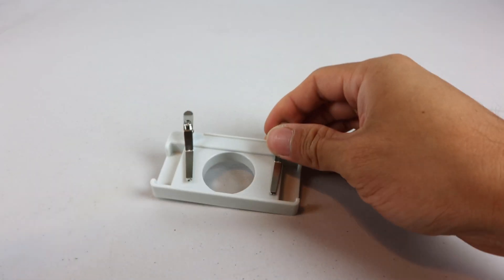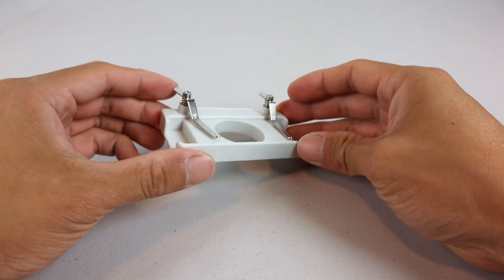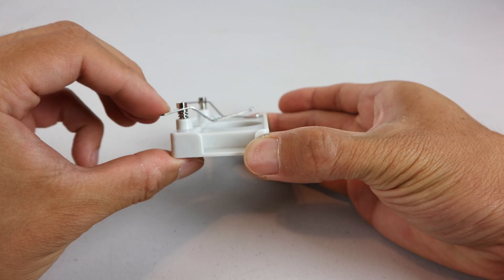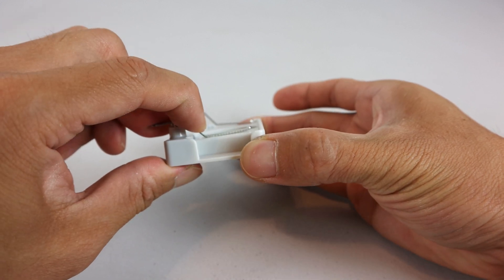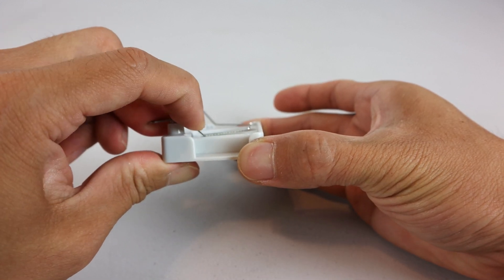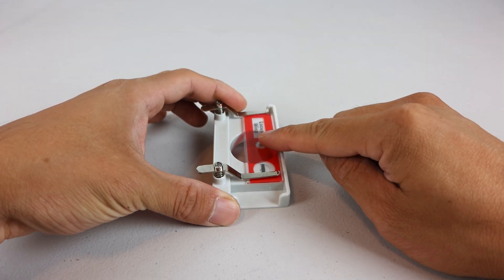To view the slides, first we'll have to place them on the stage clip block, which has spring-loaded clips that lift and rotate to keep your slides in place. But you'll notice that out of the box, the spring clips are set quite high and aren't able to tightly grip the slides.